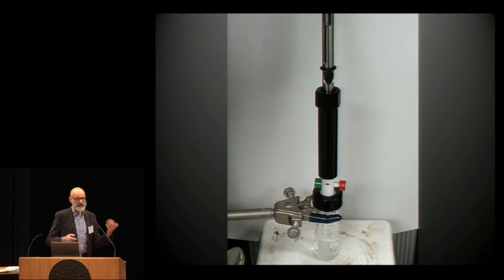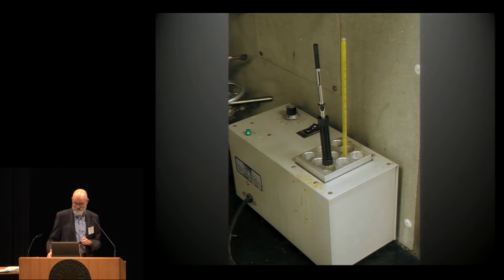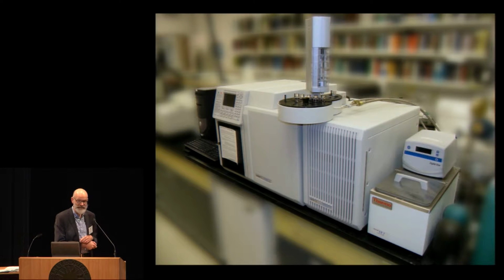So I mentioned the auto-sampler. It is closely related to quantitation, even semi-quantitative measurements. You really need an auto-sampler, and you can see why: you've got one of these holders, you've got to figure out how to hold your sample vial, you have to put your fiber in at an exact rate, for an exact amount of time, and have an exact amount of time to get back to your instrument to insert it. Otherwise, your quantitation can be off. So I have relied on an auto-sampler ever since.